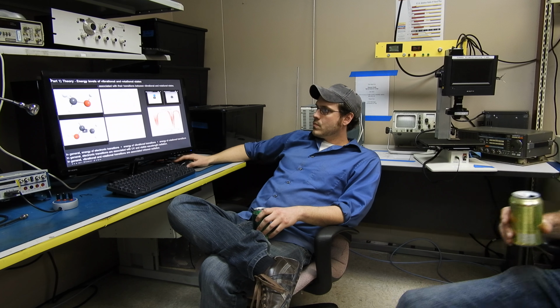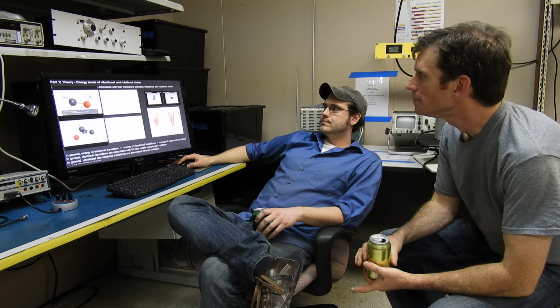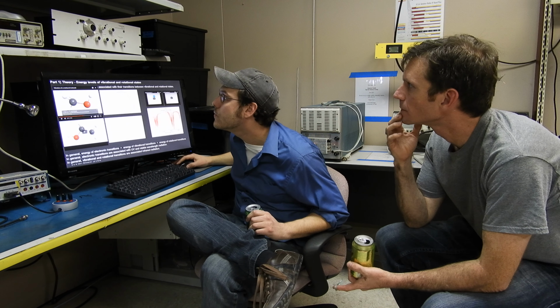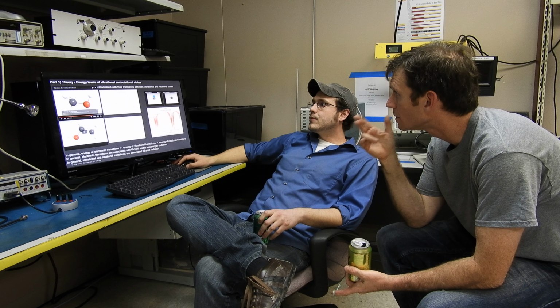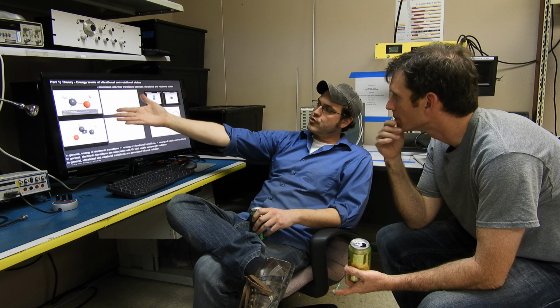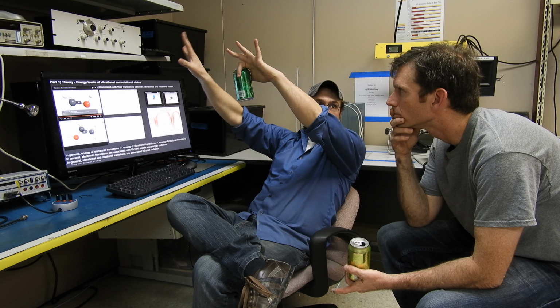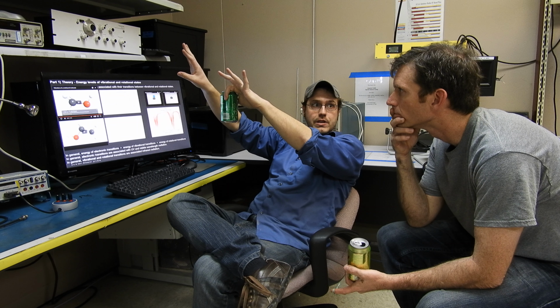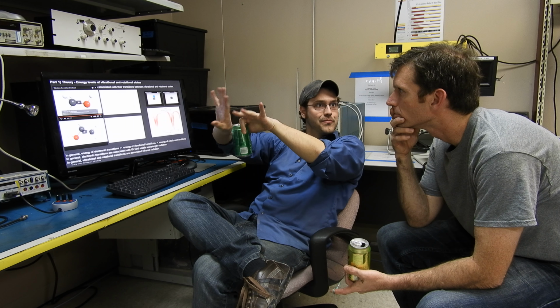We're seeing various vibrations for a methanol molecule. Are those vibrations actually representative of the way they wobble? Yeah. If you put energy into this molecule, it would start wobbling in an excited state, and then when it lost that energy to light, it would transfer back to a less wobbly state.